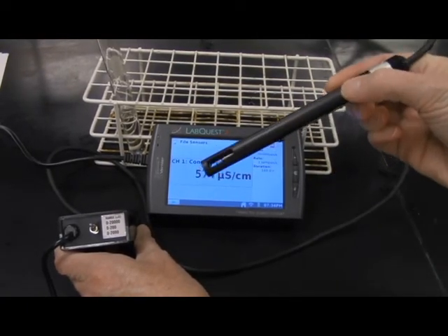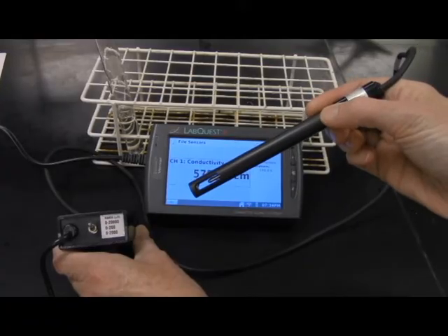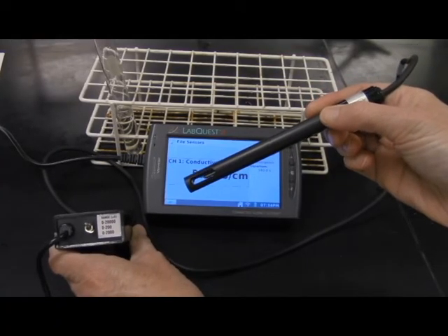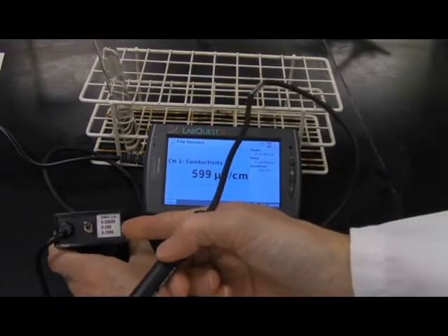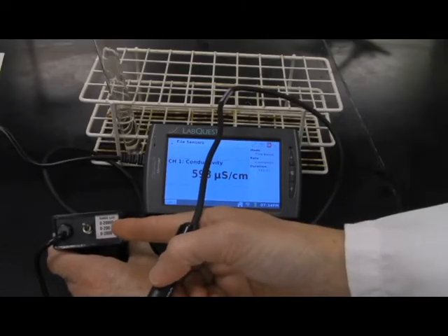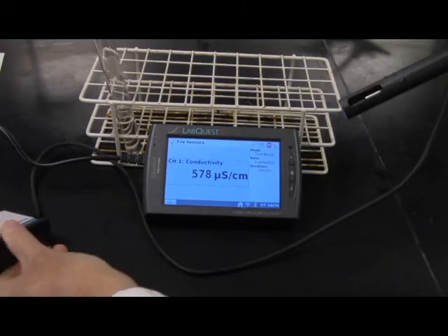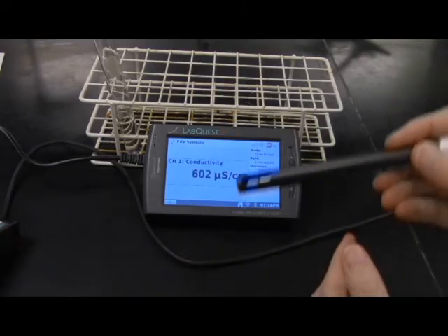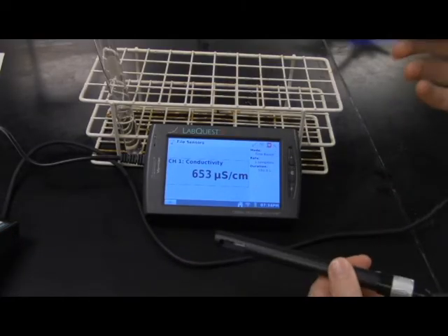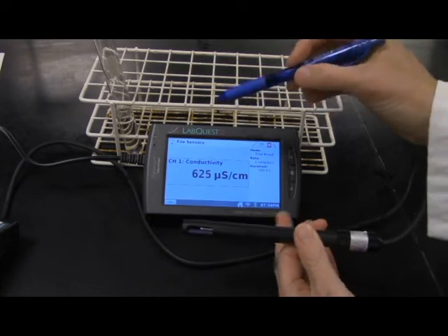We're in the lab now and this is the conductivity probe that you'll be using. The box connected to it needs to be selected for the 0 to 20,000 microsiemen range. And I'm going to walk you through the calibration procedure. There are instructions in the lab manual for it, but to show you how this works.